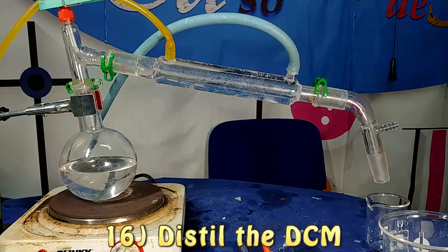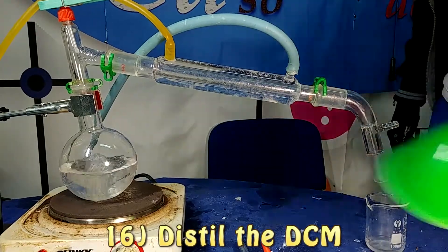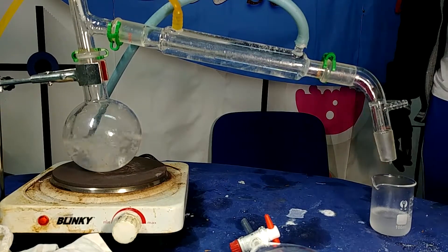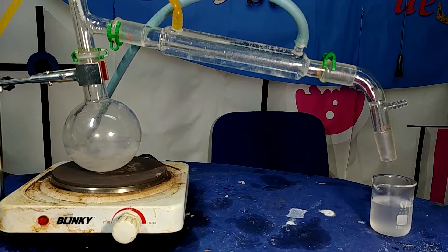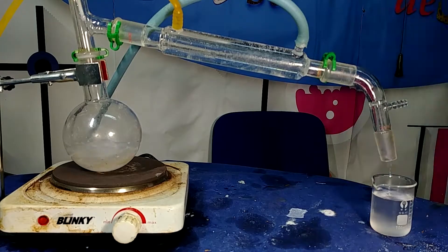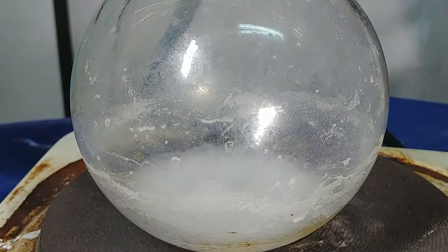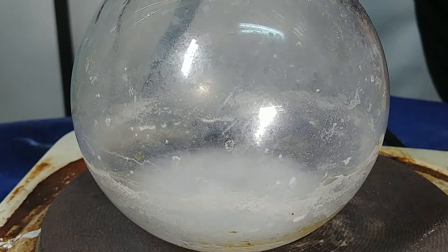After that we are going to take our dichloromethane which contains of course our extract from the cinnamon or cinnamaldehyde. Then we are going to put it in our boiling flask. We are going to boil this solution because firstly we are going to get back our dichloromethane this way and secondly because what remains will be the extract from the cinnamon which is cinnamaldehyde.